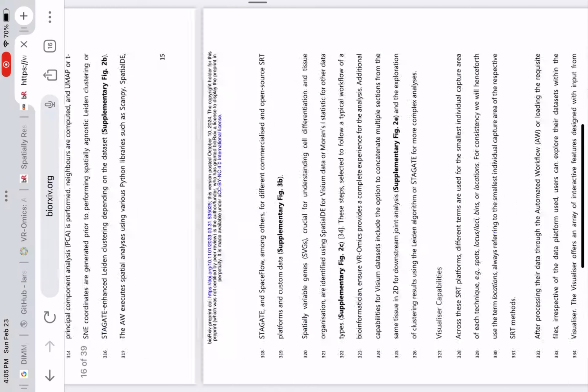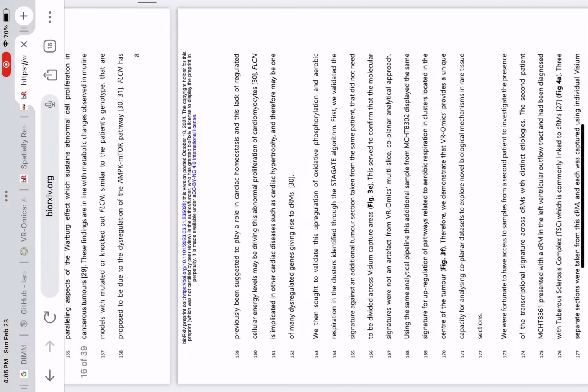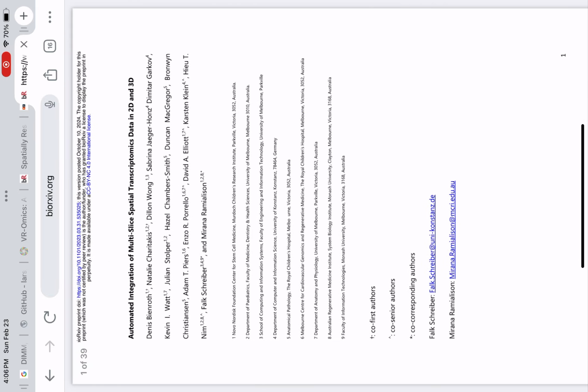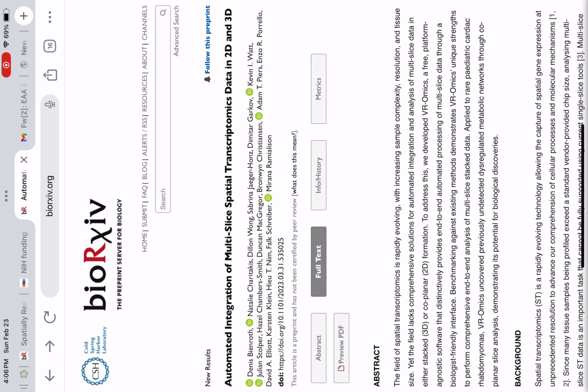These features support the systematic exploration and comparison of gene expression data across samples within a 2D desktop or VR environment. Supplementary Figure 4.5, Supplementary Table 3. Key capabilities include the visualization of gene expression, enabling insights into the expression of significant markers, such as EpCAM in breast cancer, which is associated with poor prognosis.